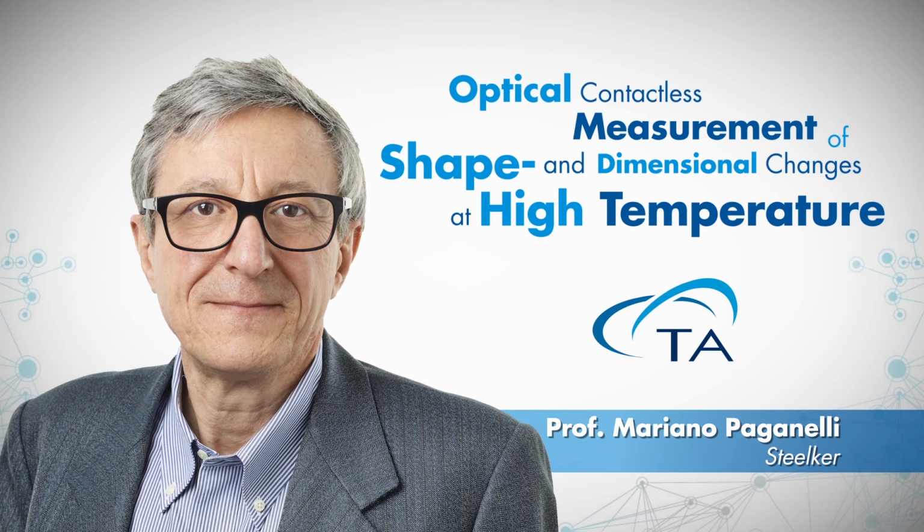Okay, thank you. And here we have a good one, highly technical, to challenge you, Mariano. Does the sample need to be under vacuum to avoid beam deflection by density gradients in the air? Well, this is really tough, a very good one. This comes from Tim. Thanks for the question.